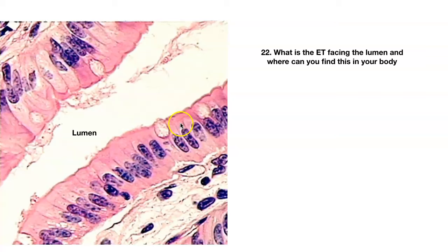Question twenty-two — what's this epithelium? You've already seen it once before. Simple columnar. Here's the basement membrane, here's the connective tissue layer. Long, elongated nuclei; here's a goblet cell. Simple columnar. Where do you find this? Stomach, small intestines, large intestines.